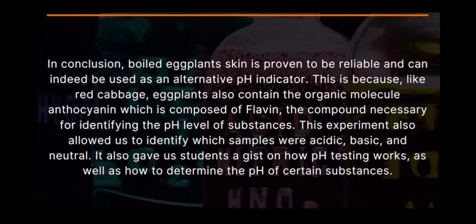This experiment also allowed us to identify which samples were acidic, basic, and neutral. It also gave us students a gist on how pH testing works, as well as how to determine the pH of certain substances.